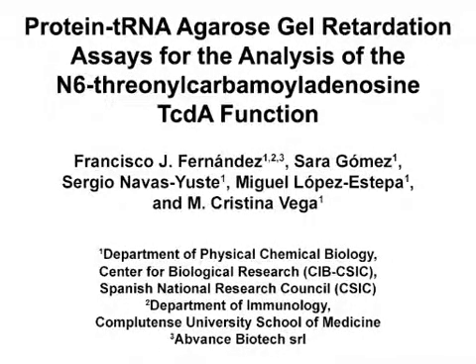The overall goal of this procedure is to demonstrate an RNA gel retardation assay designed for the discovery and characterization of RNA-binding proteins. Application of this assay is used to investigate the interaction between TcdA and transfer RNA.